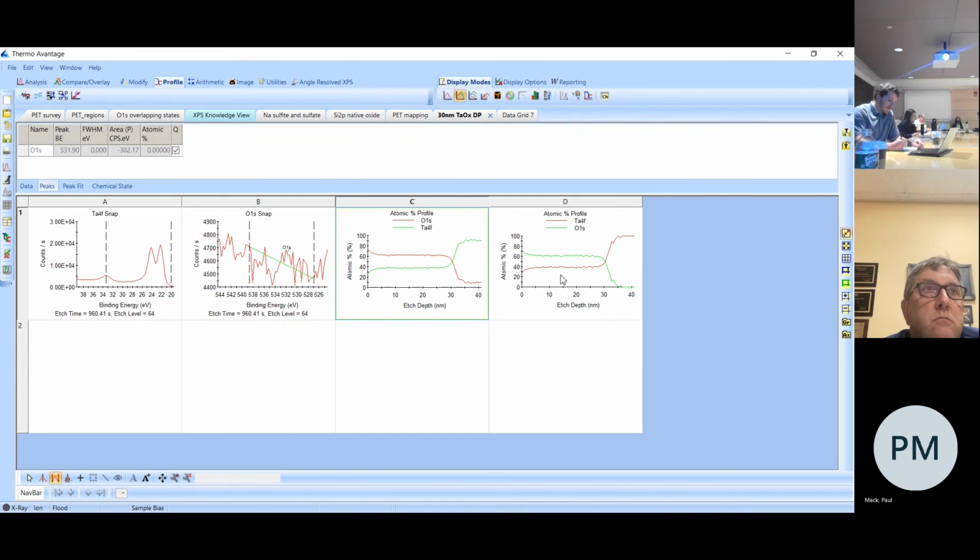Layer thickness. Is that what it's called, Paul? Is it actually called single overlayer thickness? Did I remember that correctly? Single overlayer thickness. Yes, that's correct. Yeah, look through that help file to see how you play with that. That's another way of getting a real number.